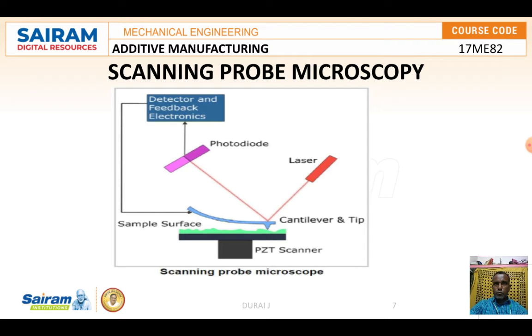The tip is moved across the sample many times. The movement of the tip is called scanning. The computer combines the data and creates the image. These images are inherently colorless because they are measuring properties other than the reflection of light.